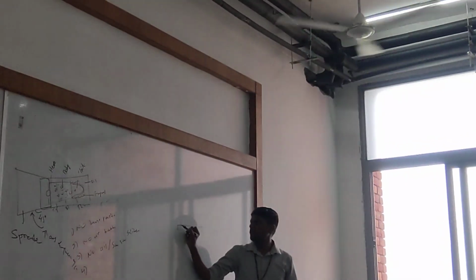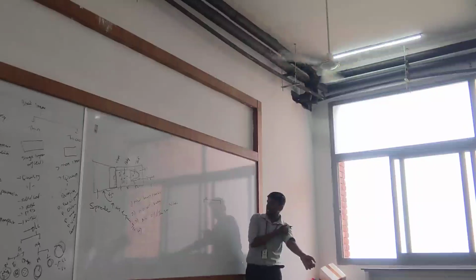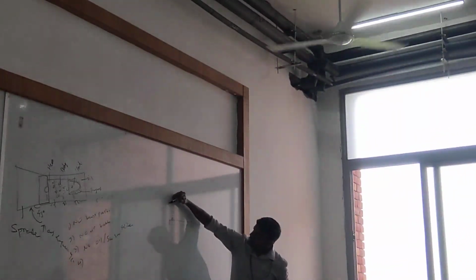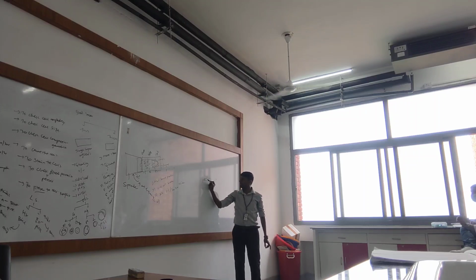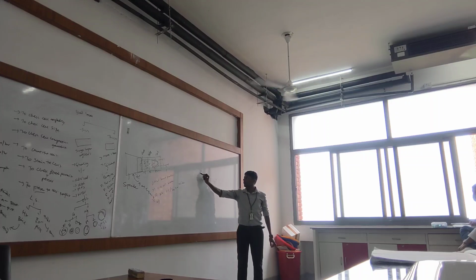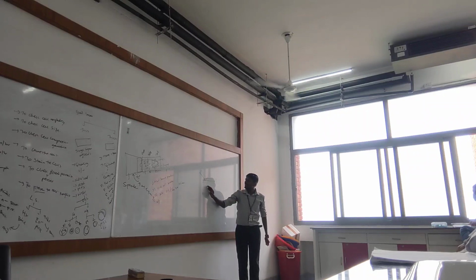Now add a drop of blood here. Add a drop of blood. Now listen, very important step. Ensure that your spreader, how to draw the spreader, let it be a 3D slide. This is 3D. Now I have become artistic. Now see.